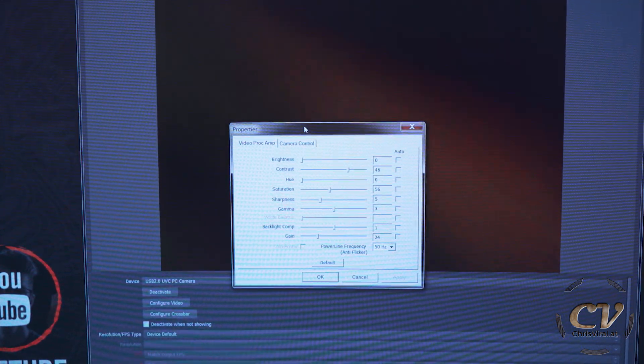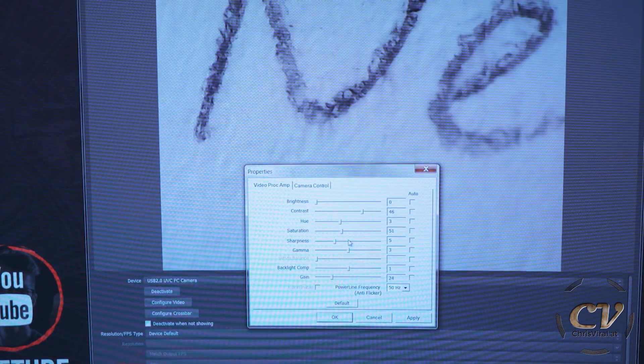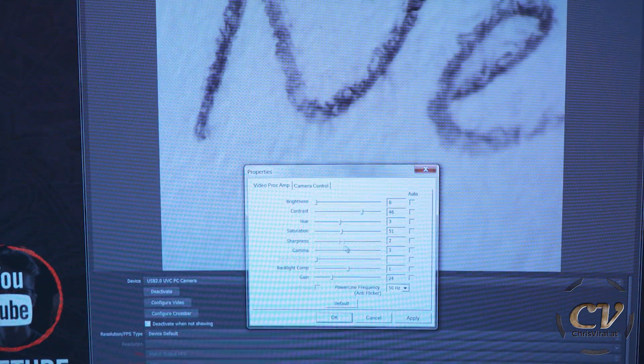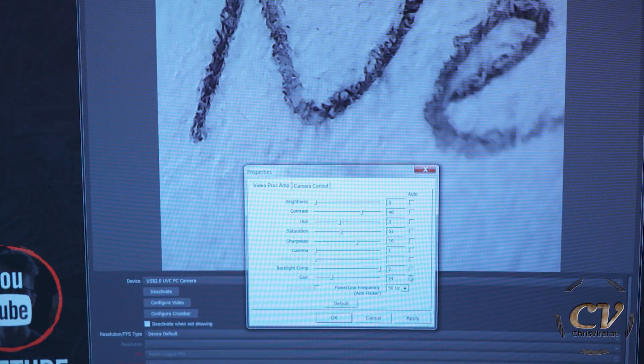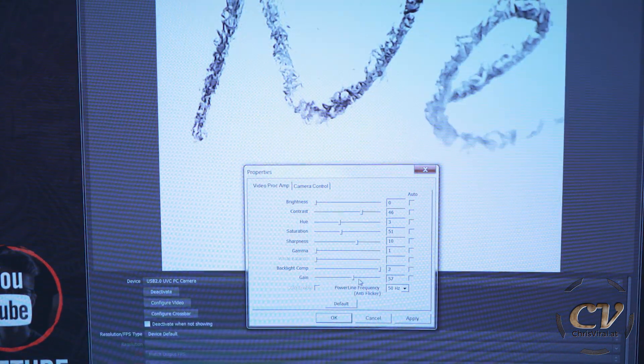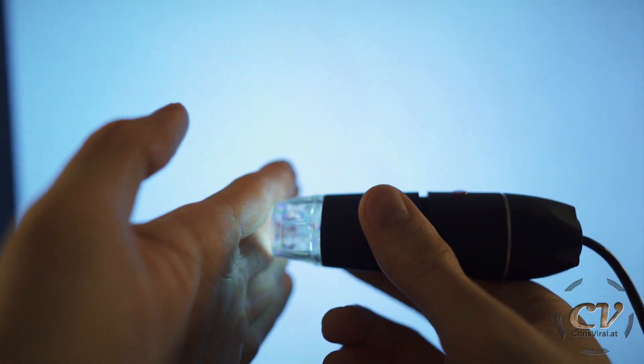There are a few video controls: properties, brightness, contrast, saturation, black and white, sharpness — that's interesting — gamma, backlight compensation, and gain of course. The image is kind of small and I'm not sure about the resolution, but if I just enlarge it, it's actually not that bad. It now fits the screen. Let's start recording. This is what it looks like recorded with my screen recorder. I'm holding it flat to the surface.